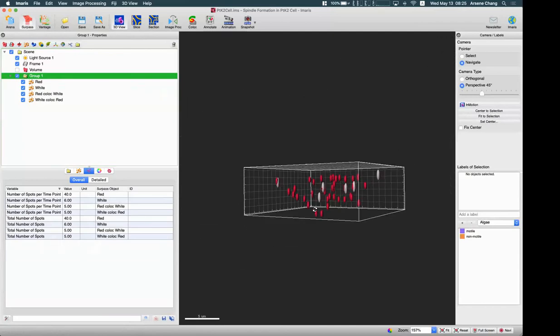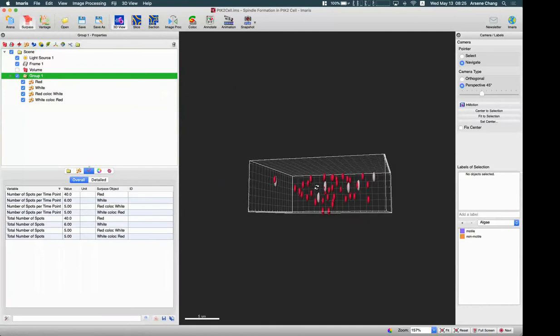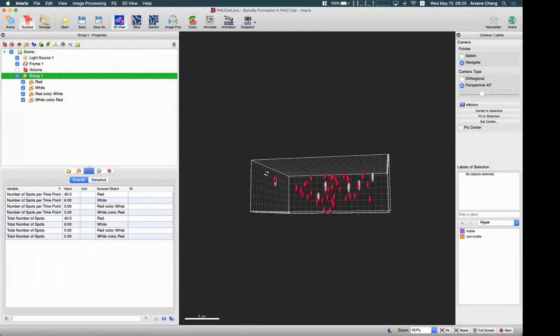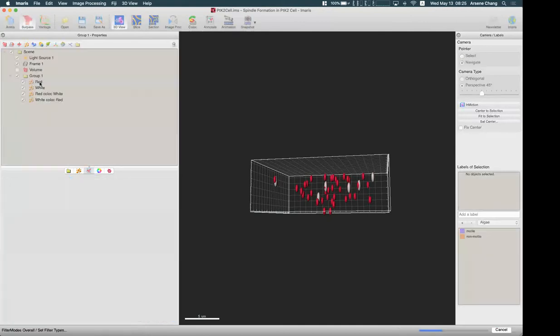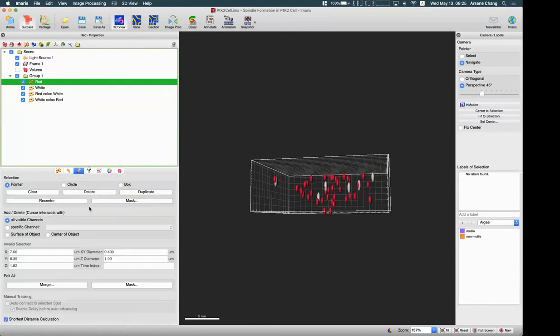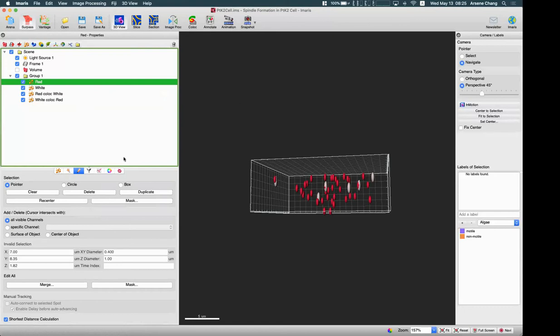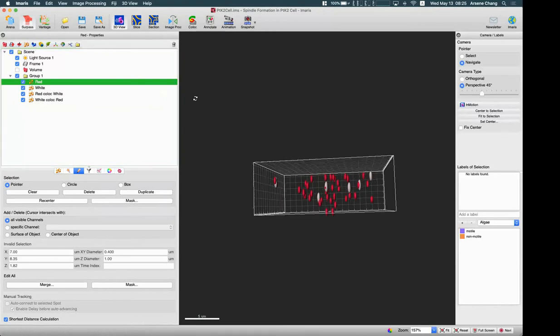So this is one way in Imaris to do the spot to spot co-localization. This function we use is called the shortest distance calculation. This is the new statistic only from version 9.5. So if you have version 9.3 or before, you don't have this default function to use. Then back to that time, we use an extension module to measure this spot co-localization, which I am going to show you.